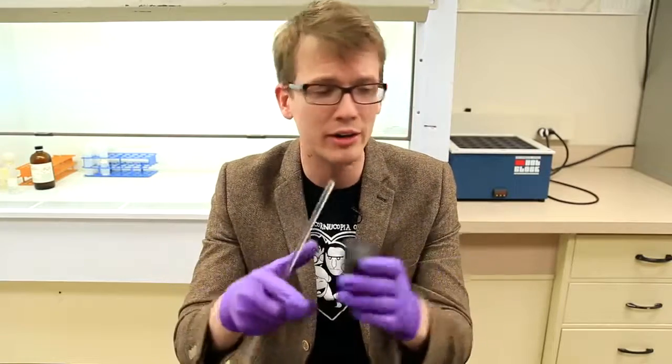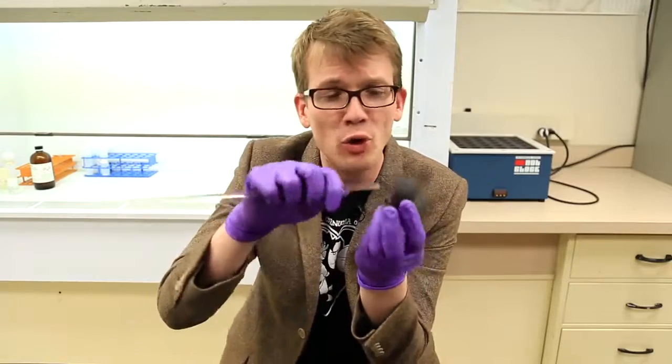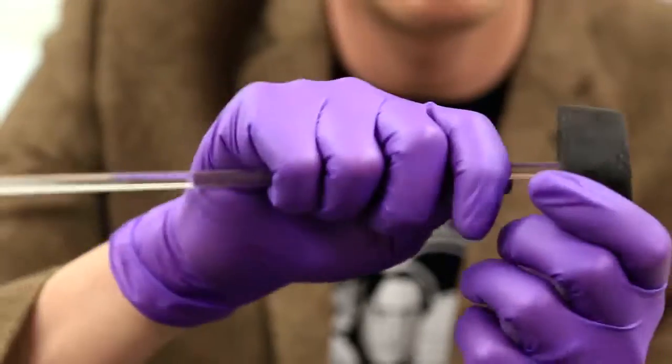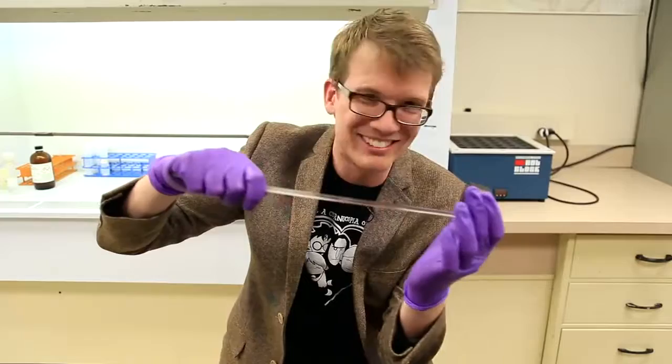So when you're doing this, and it is sometimes necessary, you can use a bit of water or a lubricant or some kind of Vaseline to make it easier to go through, and then you hold it close and make sure your hand is not on the other side. So very close and make it go through like that. Not like this, because that's, no.